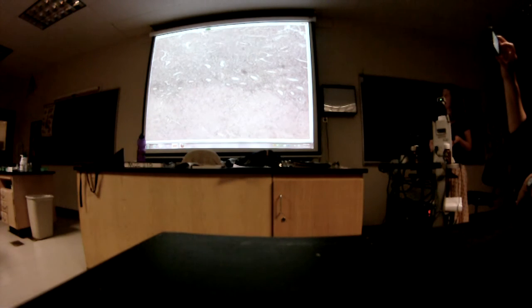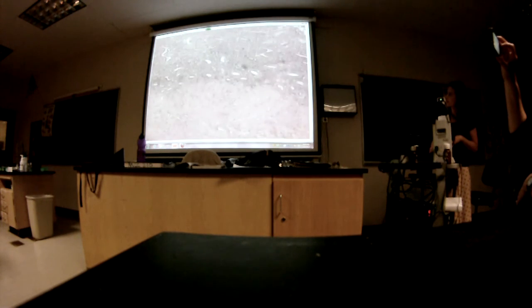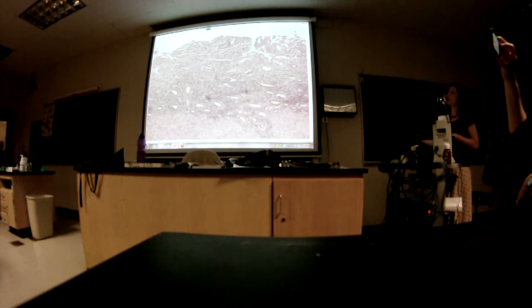So the uterus goes through cyclical phases monthly, and in this one, this is the uterus in the menstruating phase. And so if we go back up here, it kind of looks like half of the slide fell off or something, right? It sort of just looks like, oh, what happened? Where did the rest go? Where's the epithelium? Well, that's what happens in menstruation. The endometrial layer, almost all of it actually sloughs off, and that's where you get all of the bleeding. The blood vessels break. These glands disintegrate and fall apart and are sloughed off with the bleeding.